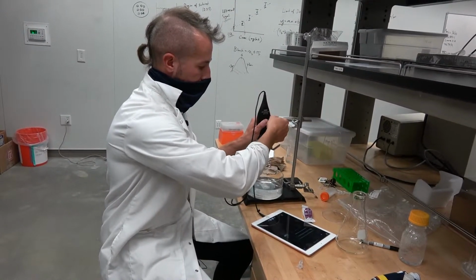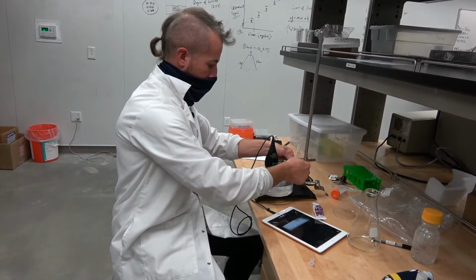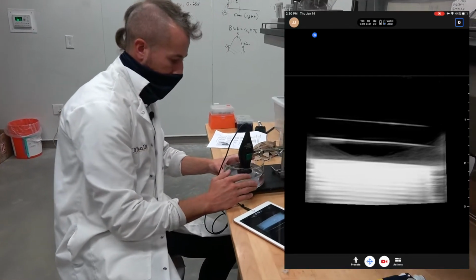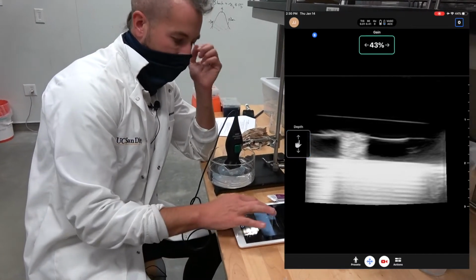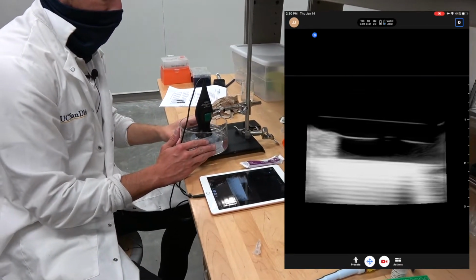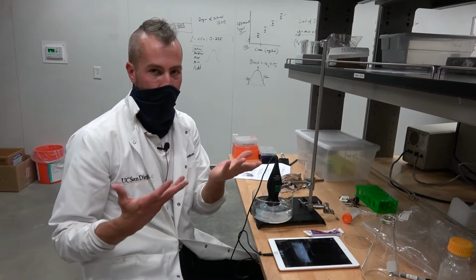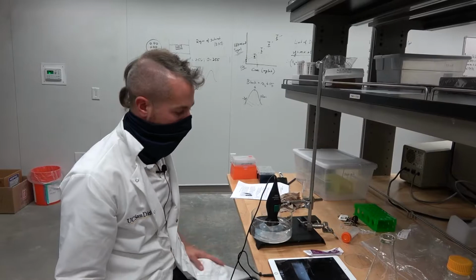one thing that's easy to do is to just hold the transducer constant and then move the sample to be on top of the transducer. So one thing that's important is your gain. So you want to have your gain the same across all samples, okay? You don't want to have your gain artificially higher than others, or else your straight line won't be straight, okay?